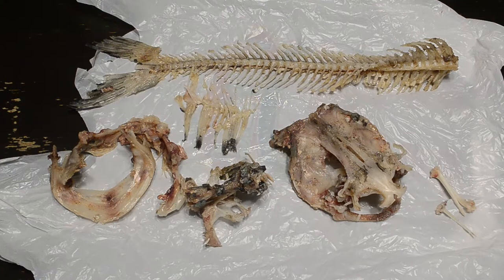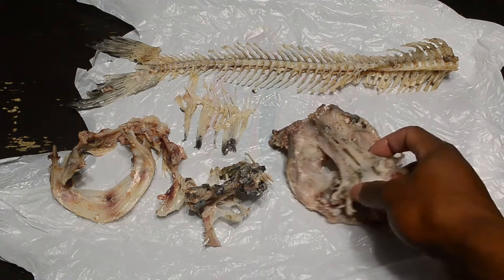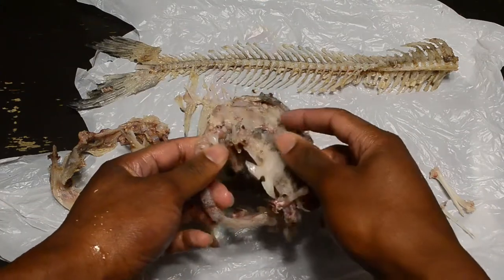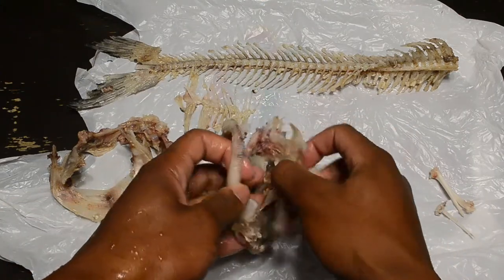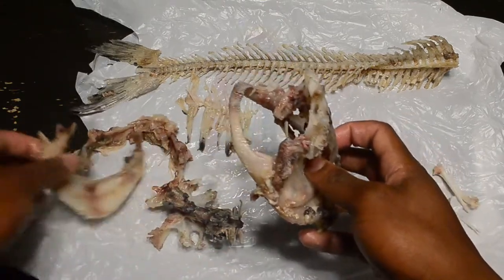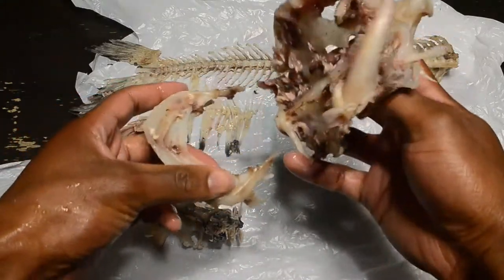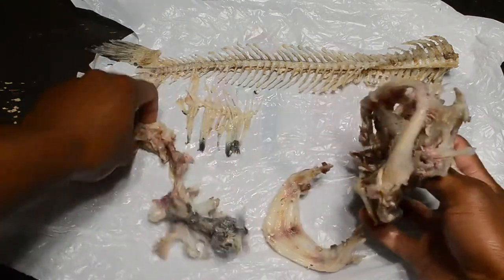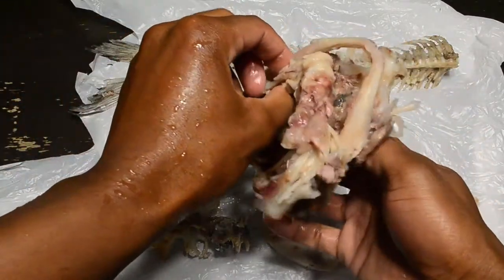I need stronger chemicals to get rid of the meat really well, but since I don't have them I just boiled it and scraped it away. So we have the skull, the upper jaw, and the mandible here.